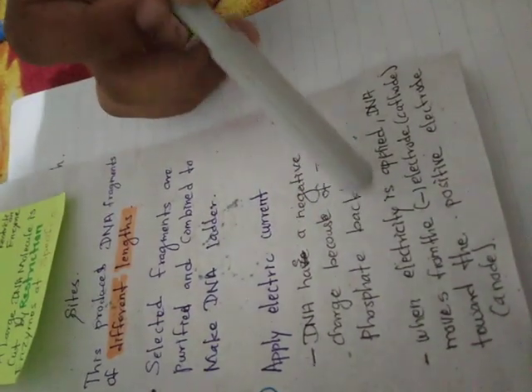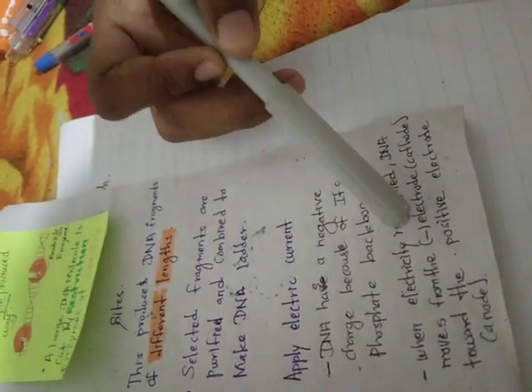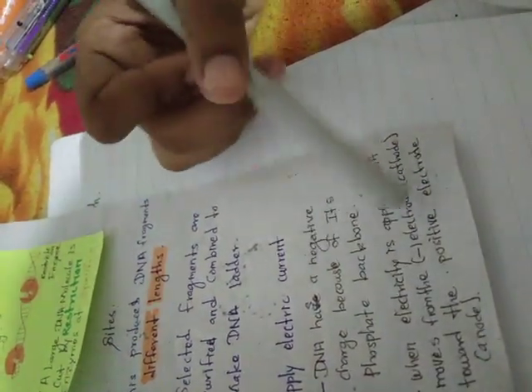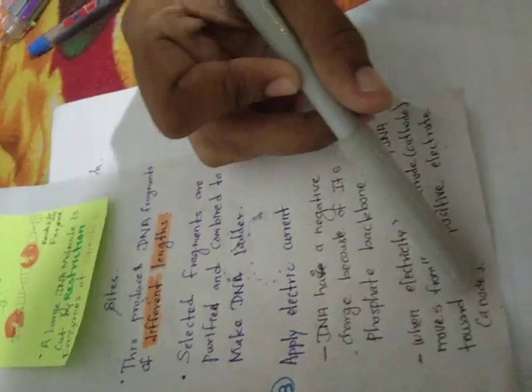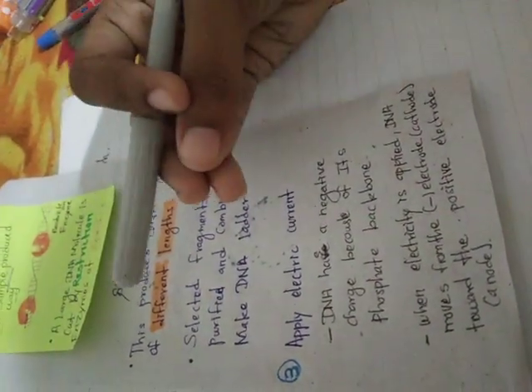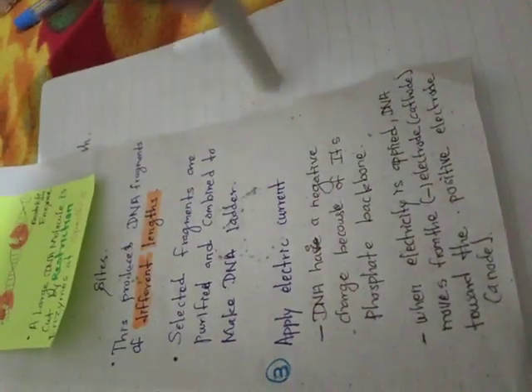So when electricity is applied, DNA moves from the negative electrode, the cathode, towards the positive electrode, the anode. So in the third process, the main thing is the DNA moving from minus to plus.